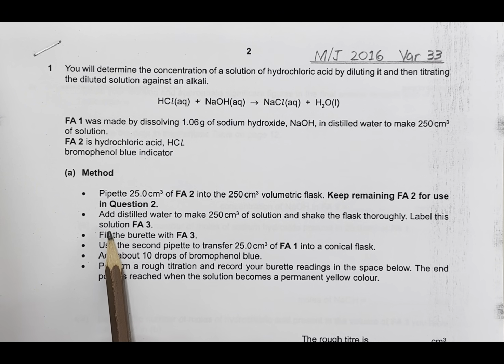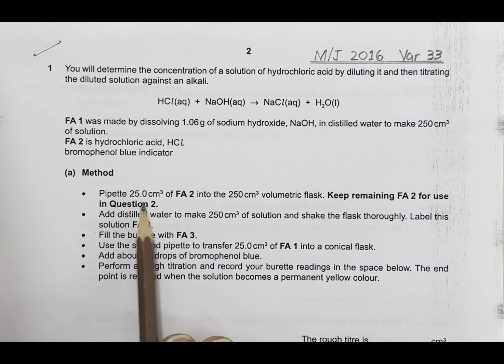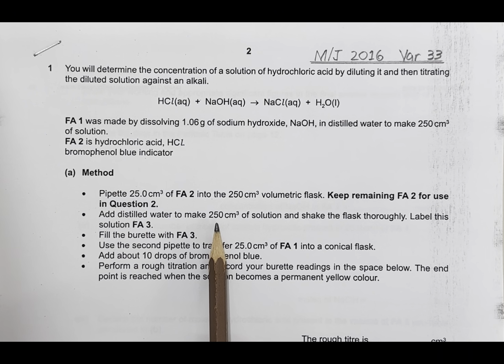Label this solution Fa3. So this Fa2 is pipetted out, 25, and by using the volumetric flask it is made up to 250. So this is what we call 10 times dilution. So 25 centimeter cube is made by adding water up to 250 centimeter cube. Now let's prepare this solution and see how the volumetric flask is used.